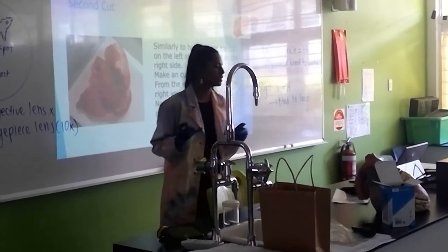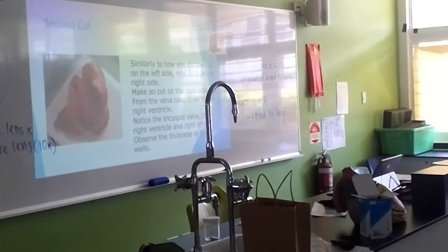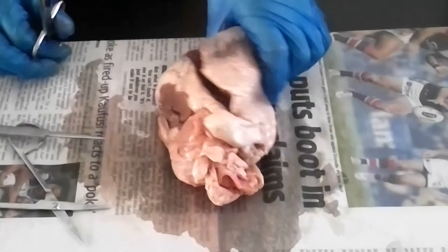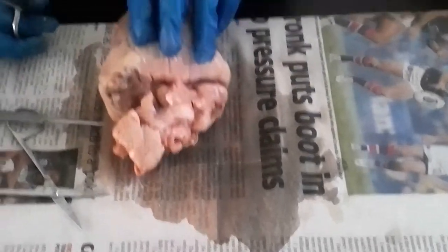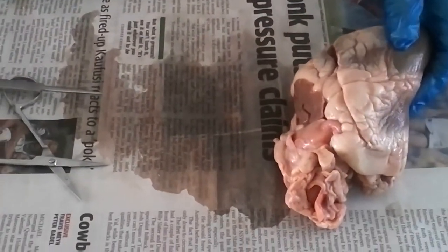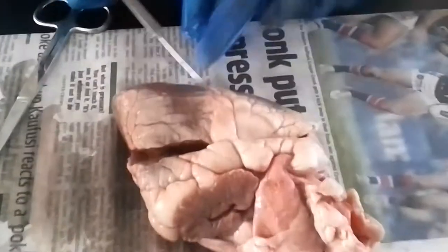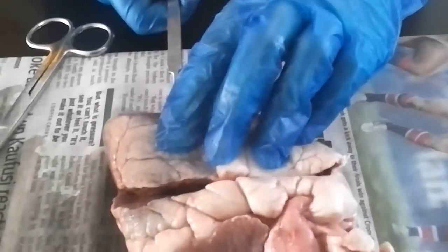Alright, on to your second cut on the right side. So doing the exact same thing. Your left ventricle is a lot thicker. Alright, so that's flipping the heart over. We go back to your other side. Oh, okay. We might have cut it a little bit too deep. That's okay. Start from here. So make your incision. Do you want to use the sharp scissors first? Make a little incision, and then cut away from you.